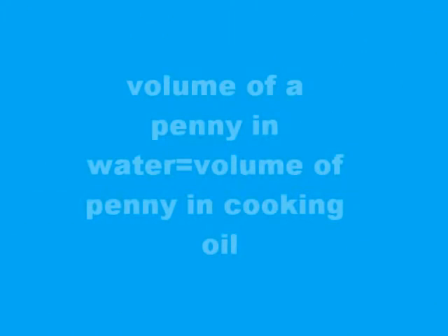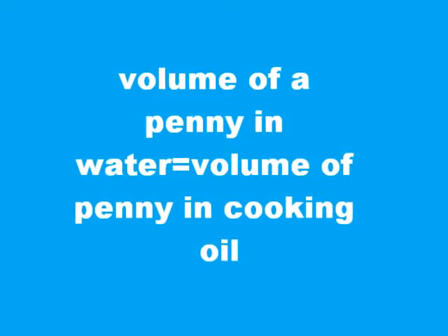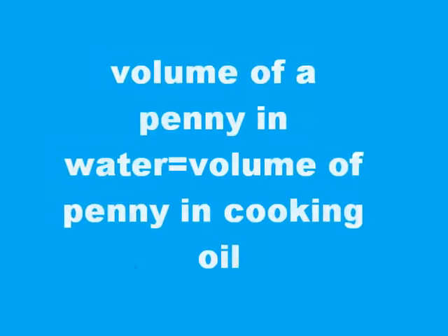Now I'm going to do a penny in oil displacement to see if the volume differs from a penny in water displacement. I'm going to start with 30 milliliters of oil. The volume went up to 34 milliliters. Now that I'm done with the lab, I'm going to follow proper laboratory procedure and clean up my materials.